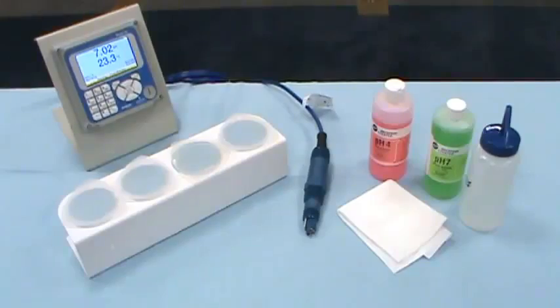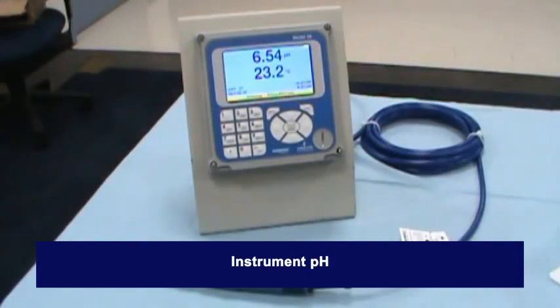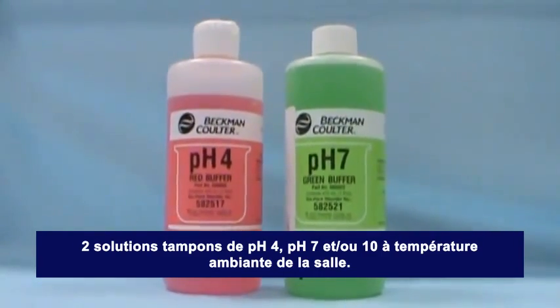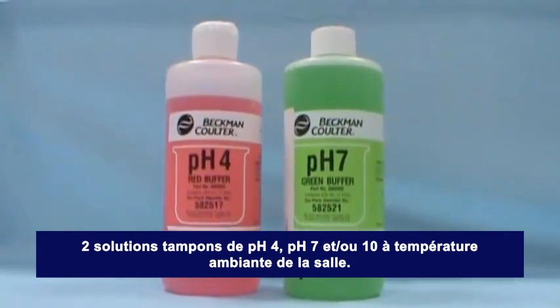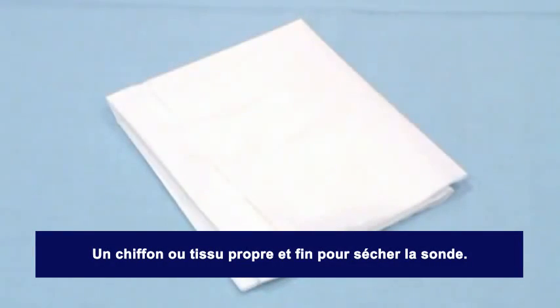To calibrate the sensor, you will need the following: a pH sensor, a pH instrument, two buffer solutions (pH 4, 7, and/or 10) at room temperature, two beakers for buffer solutions, a beaker for rinse water, and a soft cloth or tissue to dry the sensor.